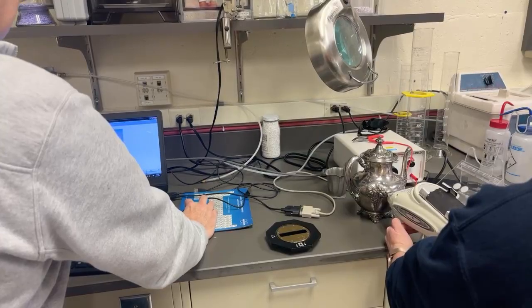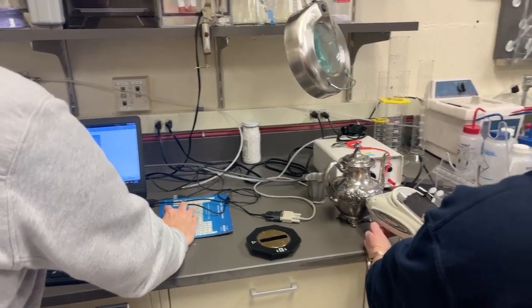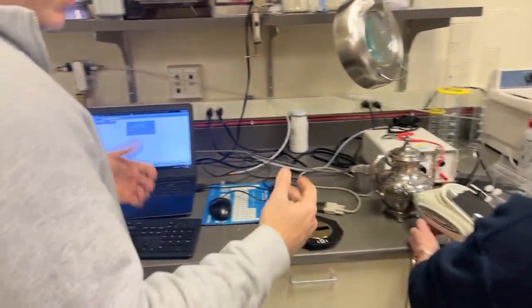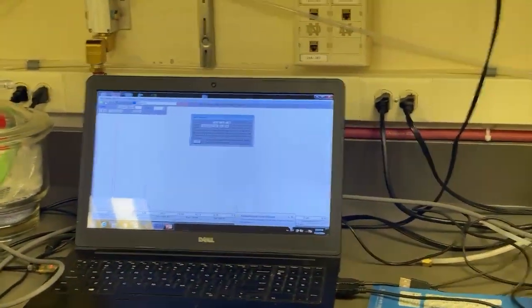This is signal now. Let's wait a few more seconds. Okay, all right, you can put it back. Okay, thanks. I got to hold an X-ray gun. That's kind of cool.